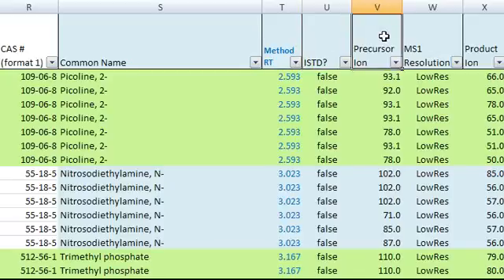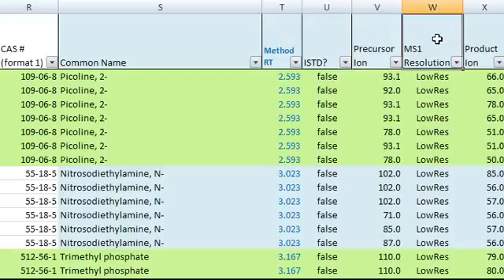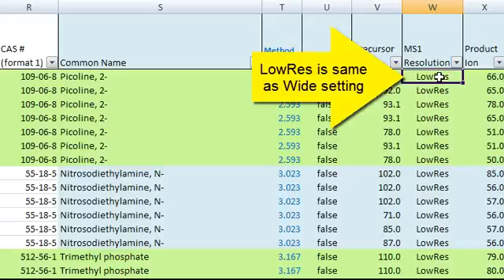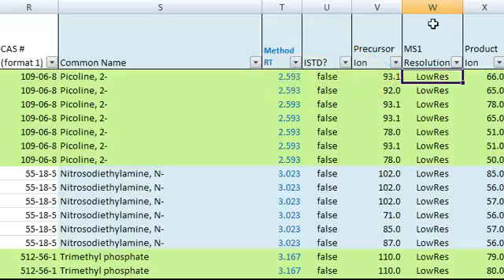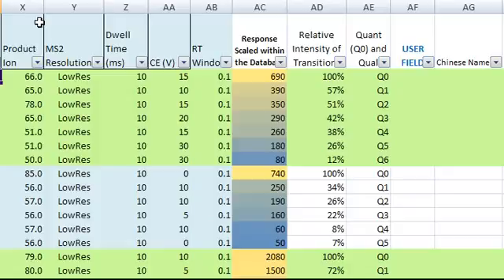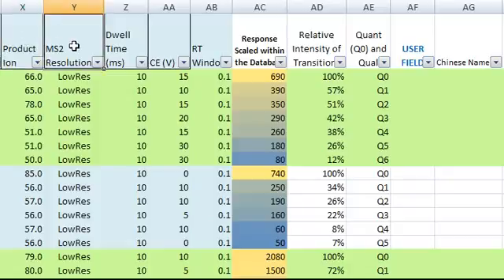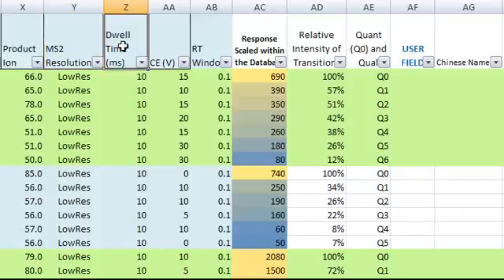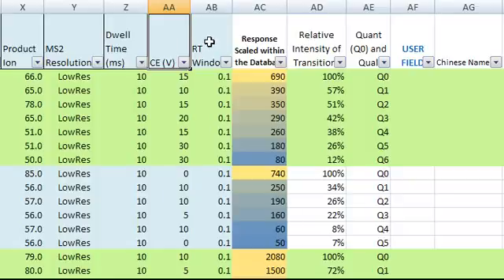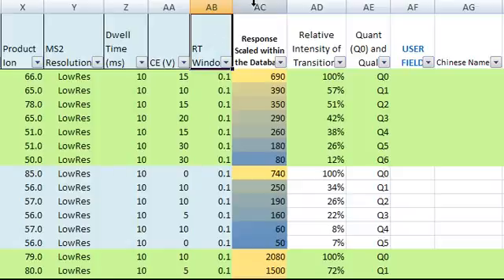This column shows the precursor ion, the MS1 resolution. Low res is the same as wide setting in the MassHunter acquisition method. This column shows the product ion, the MS2 resolution, dwell time in milliseconds, collision energy, and retention time window. This retention time window is used to set up time segments in the acquisition method.